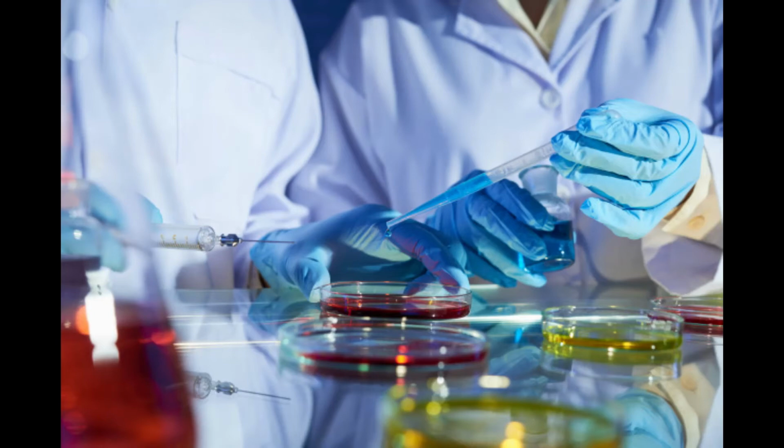And then you can flame this again. You shouldn't have to flame this every time unless you want to. I like to, just in case I goofed up one, I don't goof up all my others. So I would prefer flaming it every time just to be safe. But holding it all together is kind of awkward at first, and it'll get better. But try not to set anything down or touch anything.